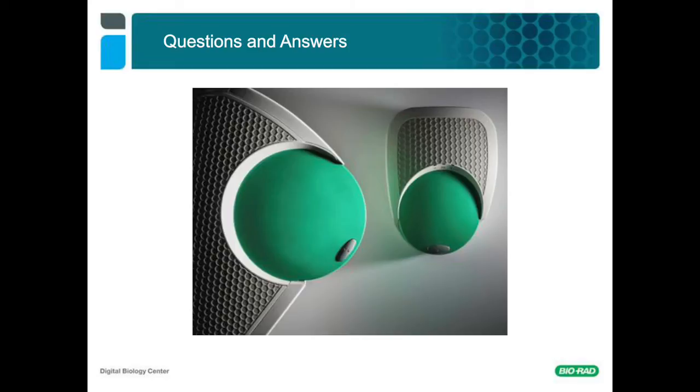So going back to sample input, what is the input of genomic DNA that you used? And then two, did you need to increase input for longer range SNP phasing? Great question. So we've done some modeling, and we have found that the optimal DNA load for phasing is roughly 200 copies per microliter. That said, we have performed experiments where we included increasingly higher amounts of DNA, basically did a dilution series, and looked to see how reproducible linkage was across the dilution series. And we found it to be extremely robust across really the dynamic range of the instrument.